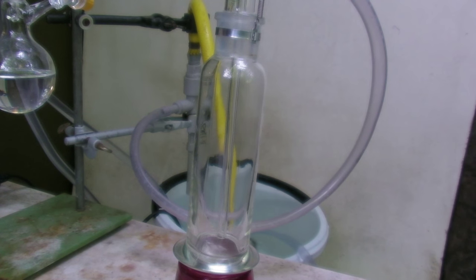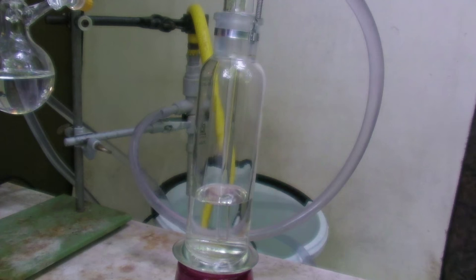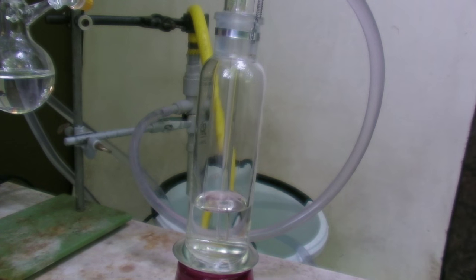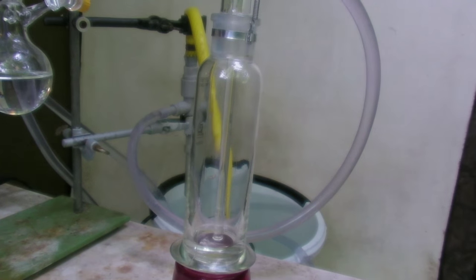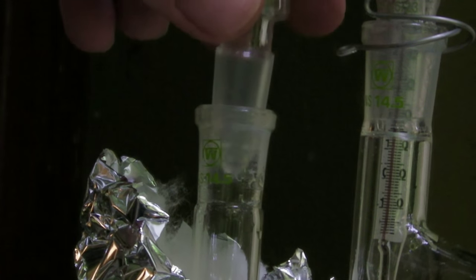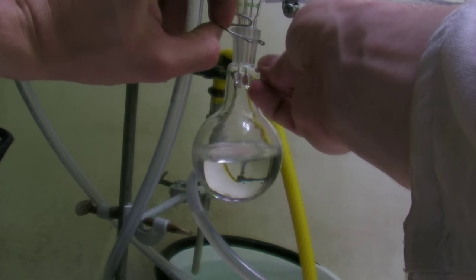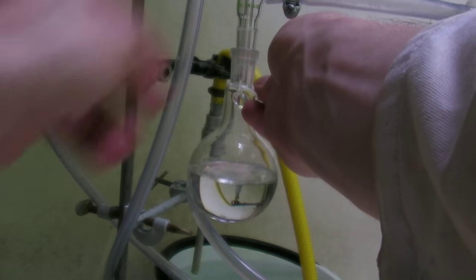When the pump is turned off, it can be seen why the gas washing flask is needed. It's interesting that the water leaves the flask again at the end. To get the pressure back to normal completely, a stopper is removed, otherwise the product could splatter when it's removed. The flask with the benzaldehyde is removed and closed directly to keep the exposure to air as short as possible.